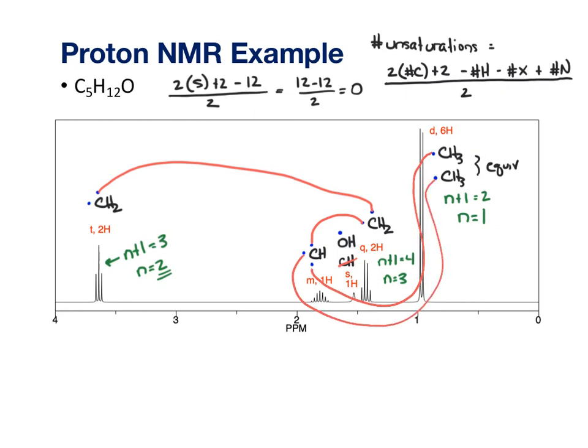All right, we're only left with a dot here, a dot here. So let's connect those together. We didn't even really use the chemical shifts here, but the reason that this signal is clear down at about 3.6 is because it's connected to the electronegative oxygen.